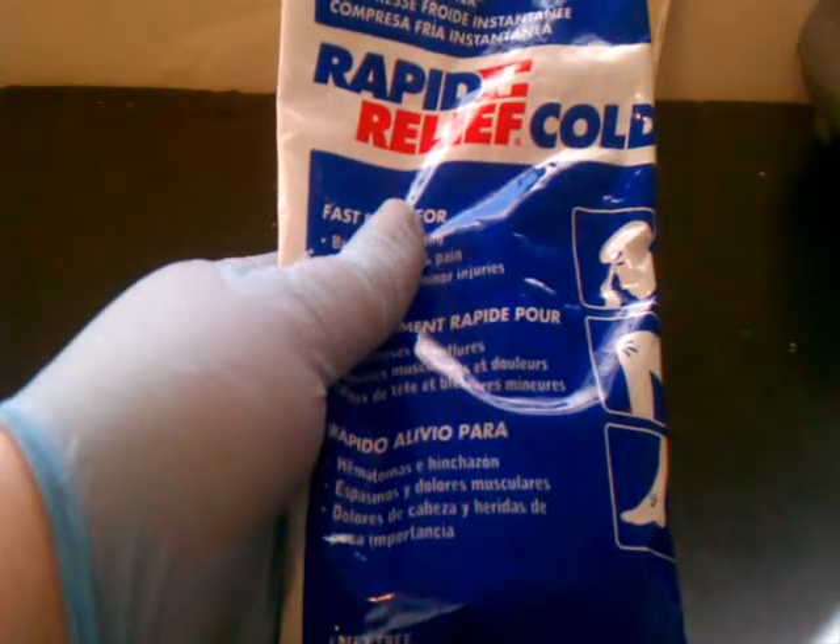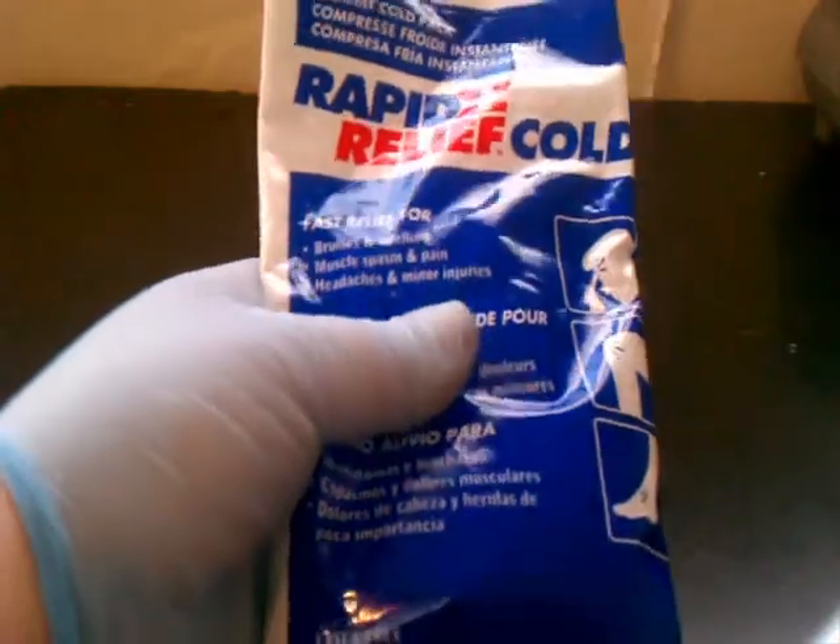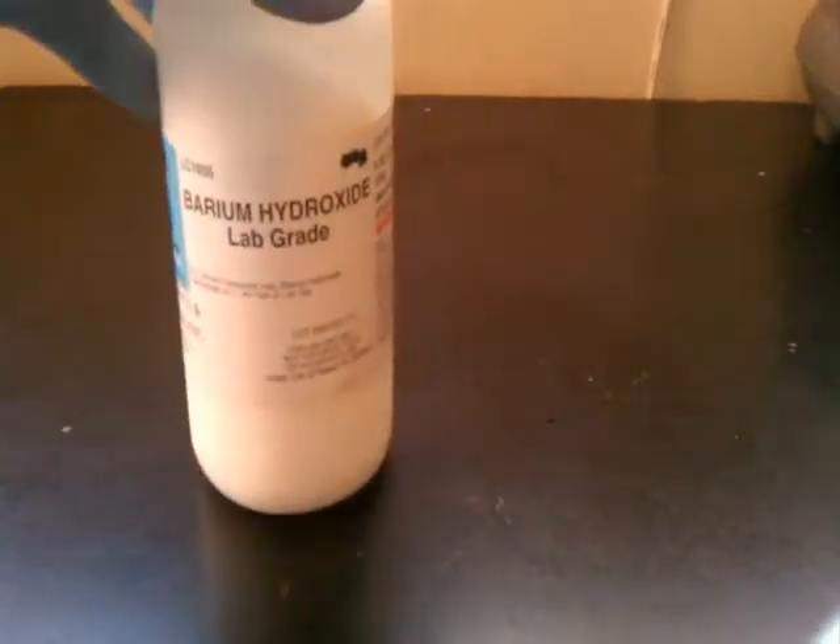The reaction that we are going to be doing today involves using the following chemicals: barium hydroxide and ammonium thiocyanate.